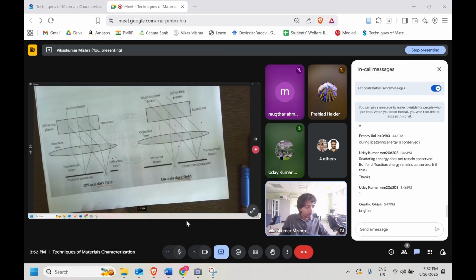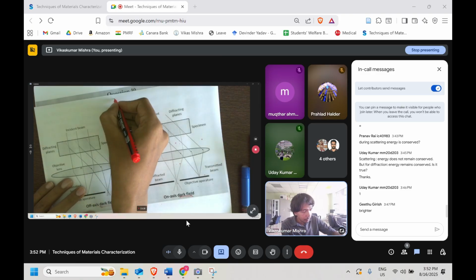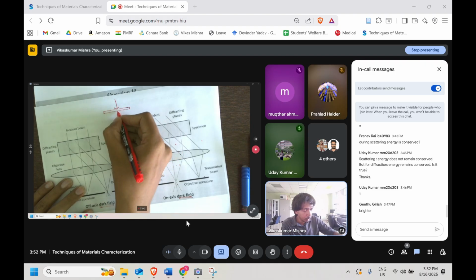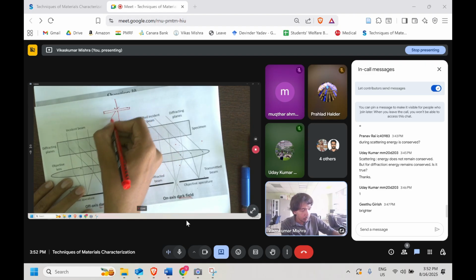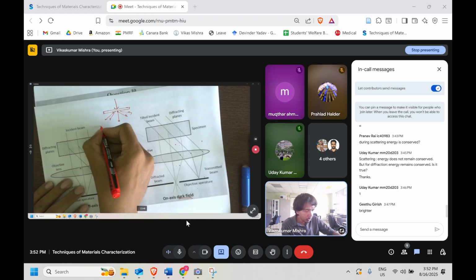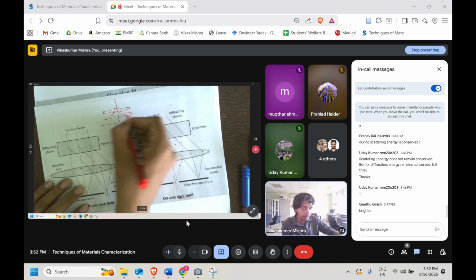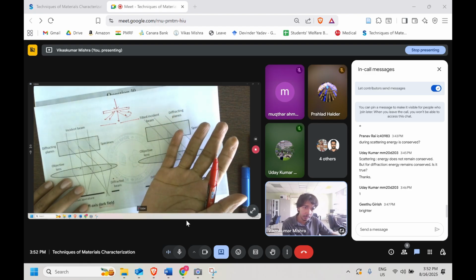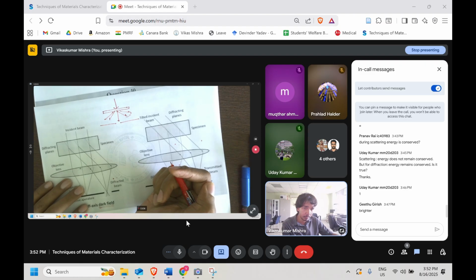One thing is that, let us say in the direct beam, your beam was coming, it was interacting with your specimen and it was going. And you were also getting some diffracted or the scattered beam. What you did, you took the aperture and you blocked all the remaining things. You are only seeing the direct beam. In that case, you will get the bright field image.